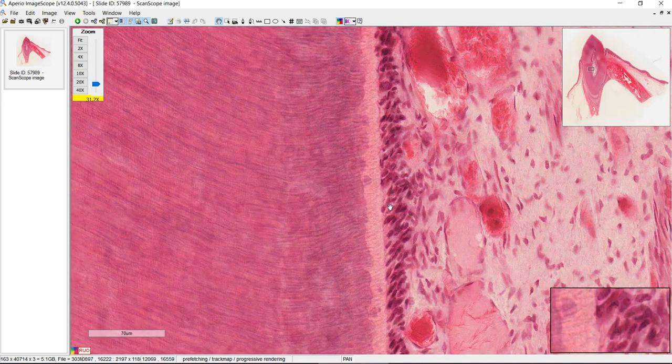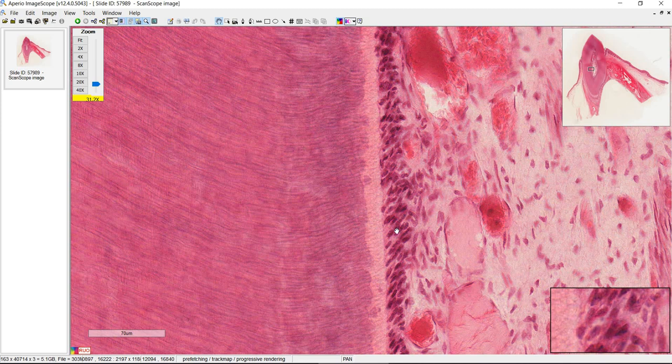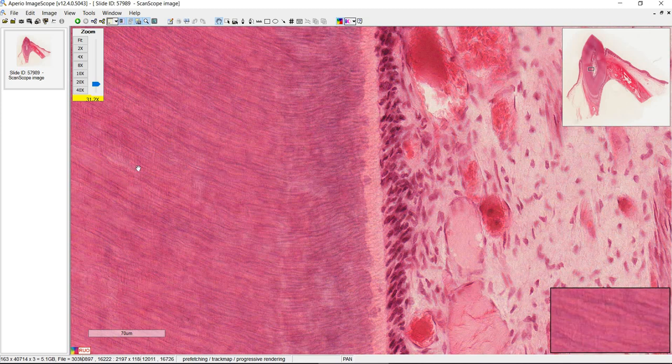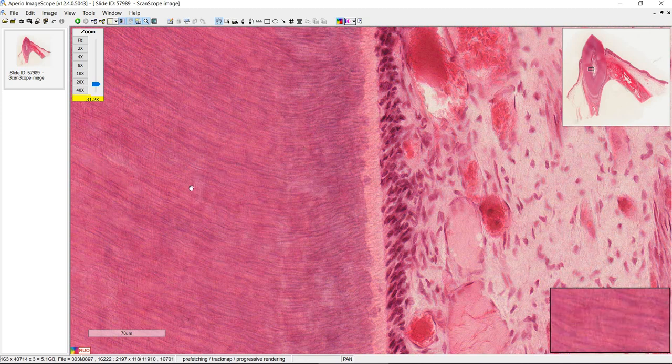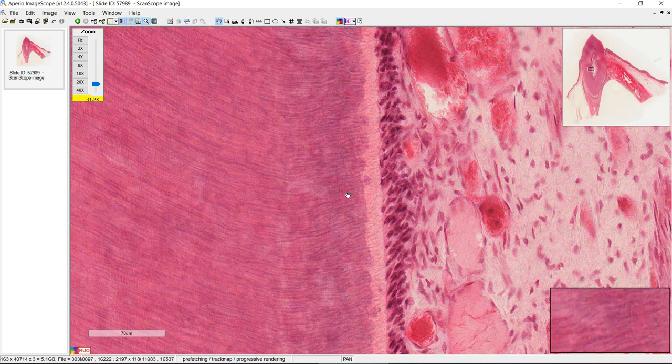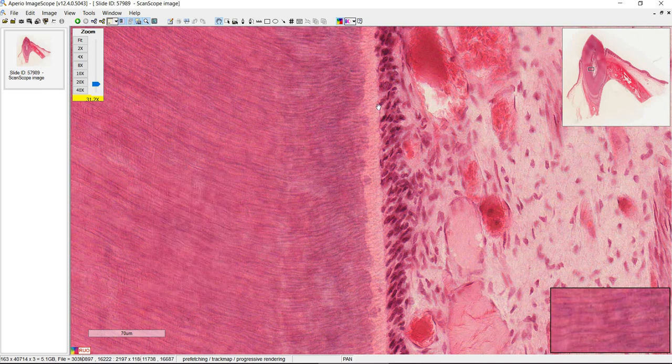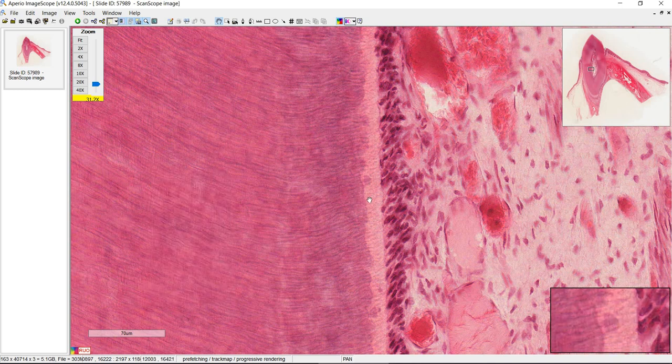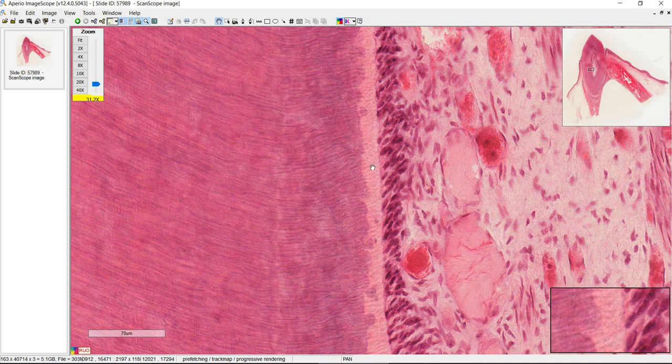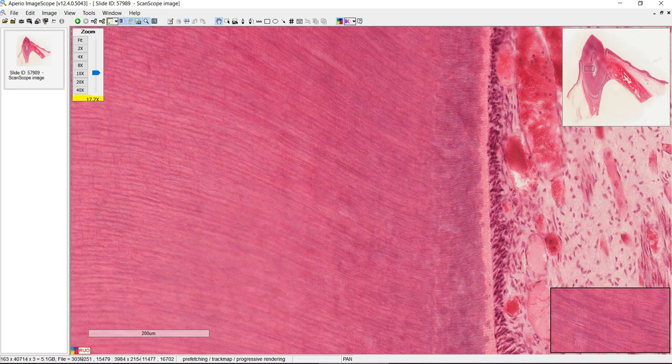At the outer edge of the pulp cavity you see odontoblasts and their job is to secrete dentin. So all of this stuff here is dentin and these lines are Tomes fibers. They're extensions of the odontoblasts and this lighter staining area here. This is pre-dentin. It's just dentin that hasn't mineralized yet with hydroxyapatite.